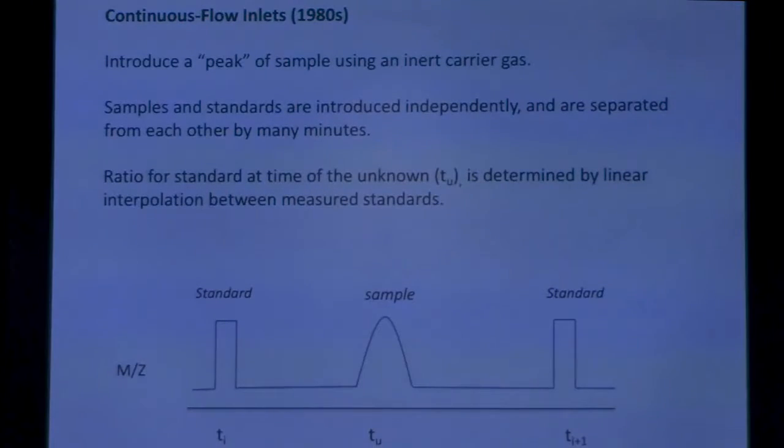How these work is really pretty straightforward now, and that is that you introduce a standard at some time, we have an unknown that comes in sometime later, and then you can have another standard after that. And instead of switching back and forth with a standard, you are measuring your complete standard, and then your complete sample, and then another complete standard.